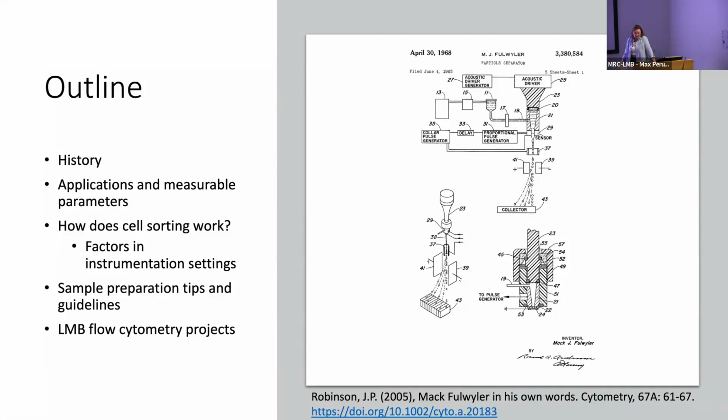Where a jet is vibrated, these little drops are broken off and then charged and then deflected. And he thought, this is a really brilliant idea. Isn't there a way that we could actually incorporate a cell into these drops and then separate them out? So he did that. And this is one of his first sketches.